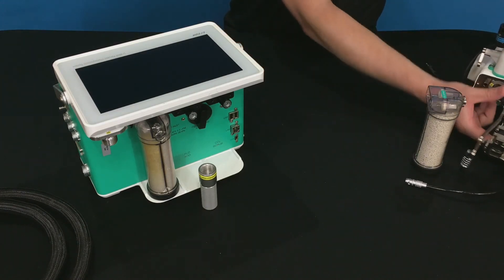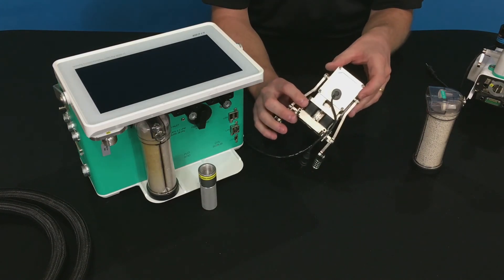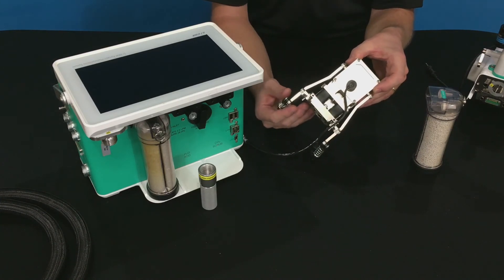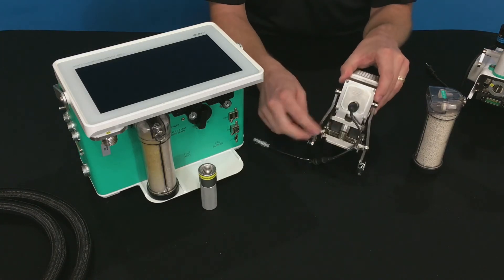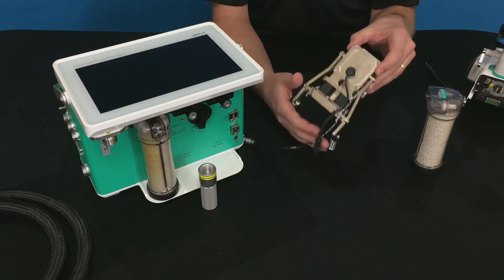There are also some bellows on the system. These bellows act as a hinge for the chambers, but they also serve as the air passage from the mixing volume out to the chamber. They're made out of neoprene, so they should be fairly robust. If you do need to replace them, they can be removed by taking some screws loose. We do supply some of those in the spares kit that came with the instrument.